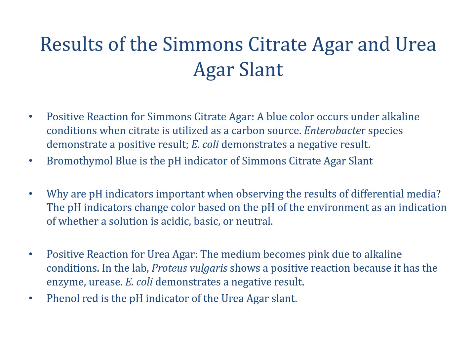Urea is also a biochemical test and is differential. It tests for the presence of the urease enzyme.